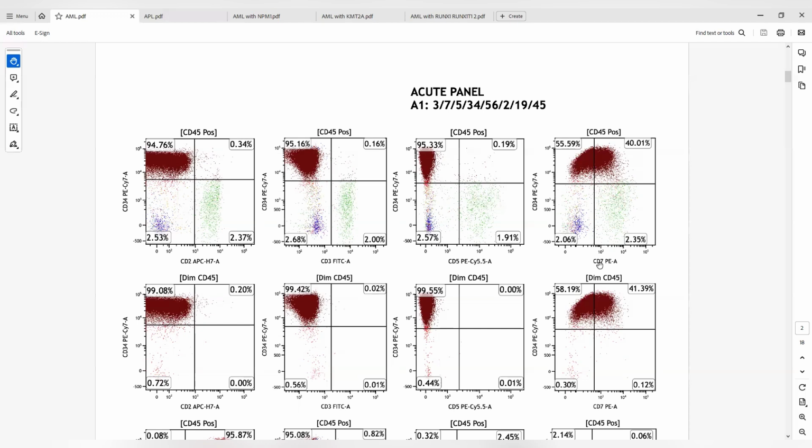You have to remember that acute myeloid leukemia may aberrantly express lymphoid markers, and lymphoblastic leukemias may aberrantly express myeloid markers as well. That's why we need a combination of multiple markers in order to establish the lineage of a specific leukemia case. And that's why it's always important to look at the general picture, looking at the morphology, looking at flow cytometry, and looking at multiple markers, and then looking at the cytogenetic and molecular tests as well.